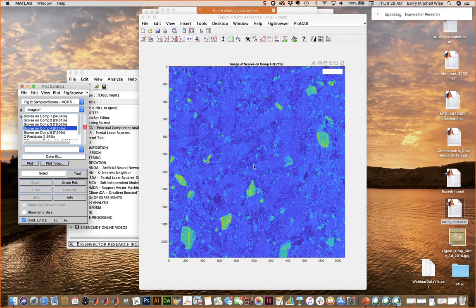All right. I had a question here. It's asking if this data set is available somewhere. Or no, I'm sorry, the 2018 one. The chemometrics one.